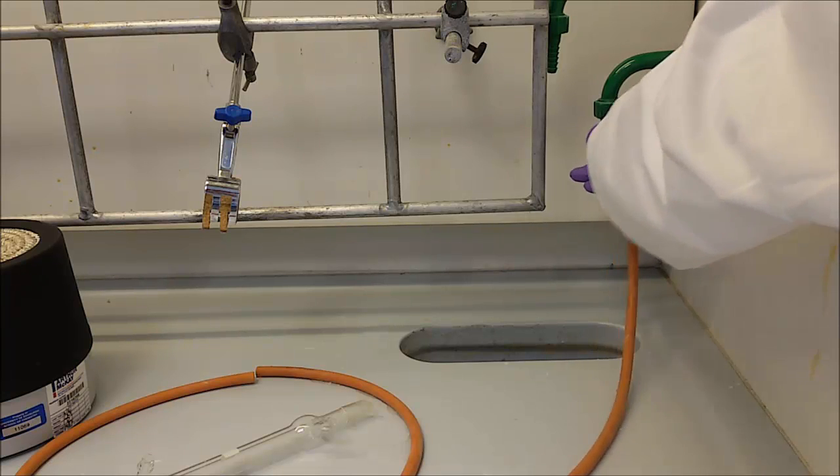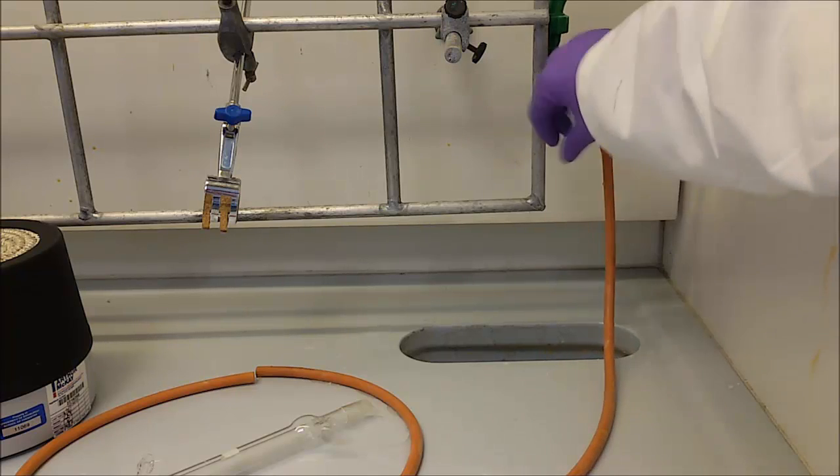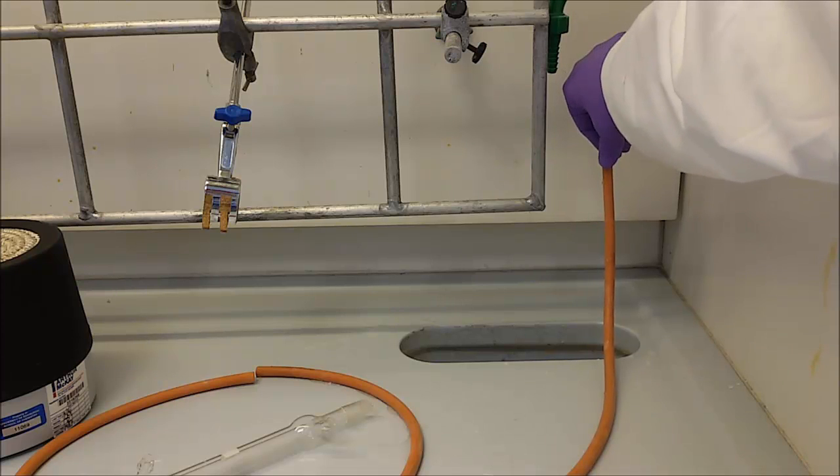Firstly place one end on the tap, then connect the second end of this to the condenser. This will be the water inlet so has to be on the arm of the condenser that is further from the heating source.